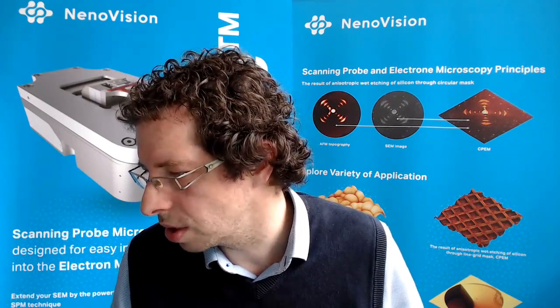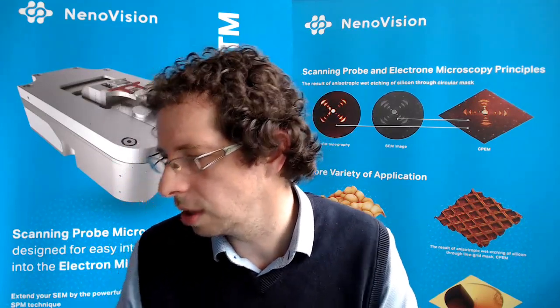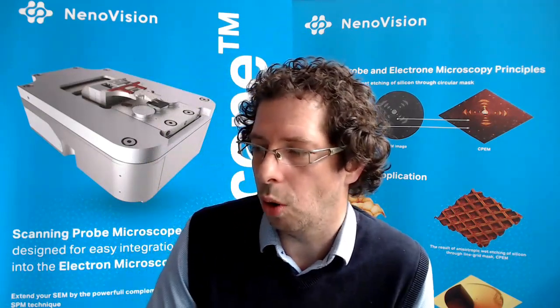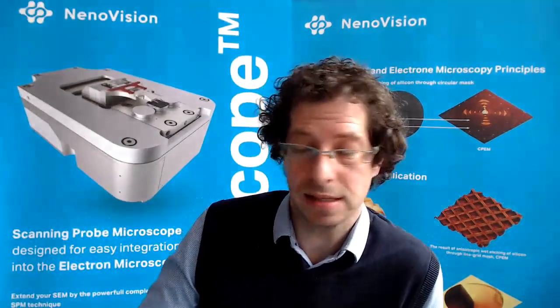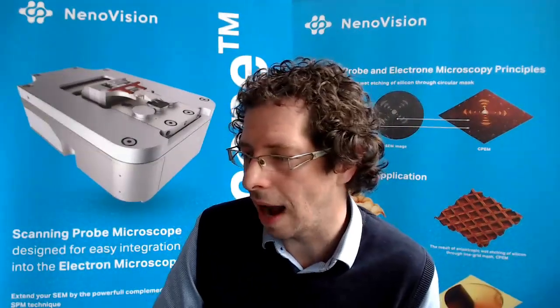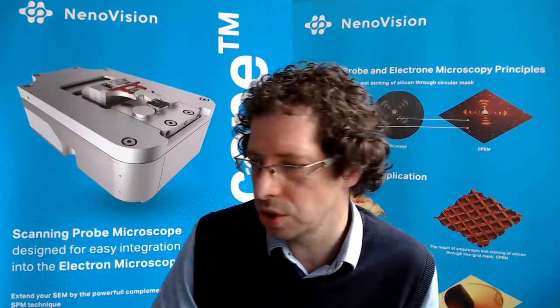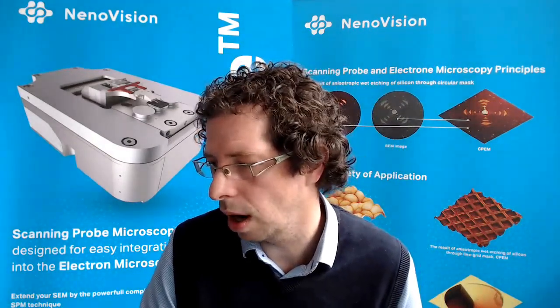What is the best resolution you can get in the X, Y, and Z axis, and what's the probe recommendation to get the best resolution? We have 0.2 by 0.2 nanometer resolution in the X and Y directions. In the Z direction, it's 0.04 nanometers, so 0.4 angstroms. For the best resolution, we usually use the Akiyama probe, which is standard and sufficient. This is how we got the results I was presenting.